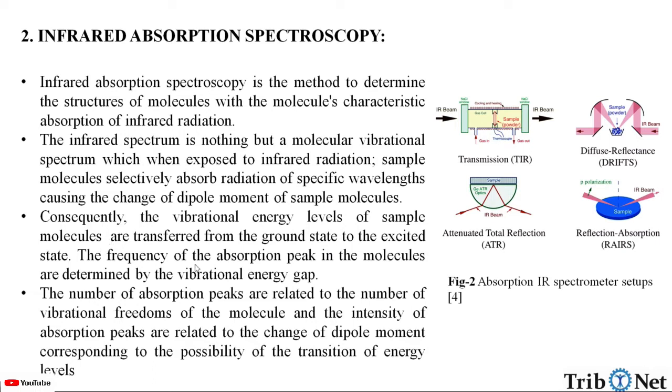The frequency of the absorption peak in the molecules are determined by the vibrational energy gap. The number of absorption peaks are related to the number of vibrational freedoms of the molecules, and the intensity of the absorption peaks are related to the change of the dipole moment corresponding to the possibility of the transition of the energy levels. Here in this figure, we can see the absorption IR spectrometer setups.